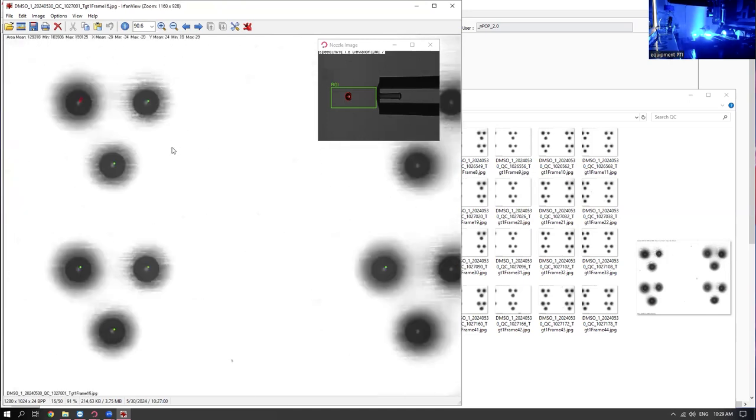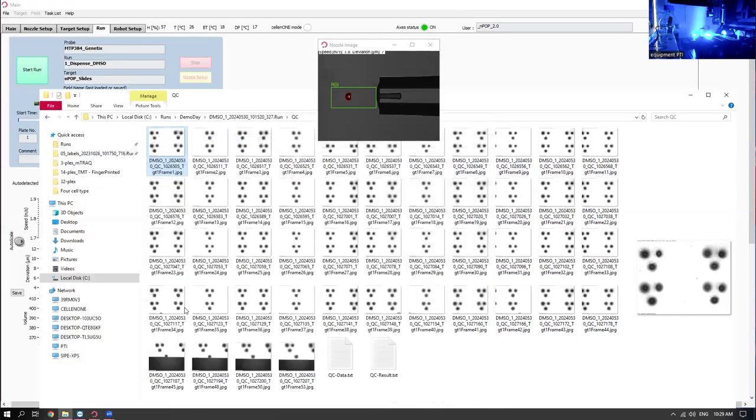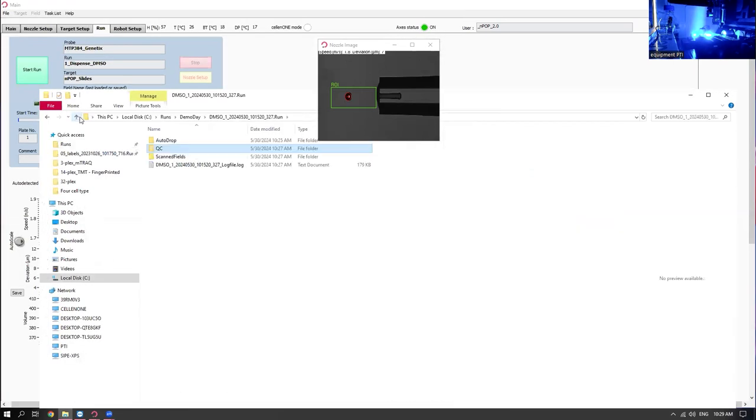And then you can decide, at this point, you could start over again. Maybe you aspirated a big particle and it made things really messy. You could wipe that slide clean and print just that slide again. Or maybe you say, oh, it's just one of these clusters. I'm going to avoid running those through my mass spec. And so you can continue like that. In any case, this all looks like it passes our QCs.